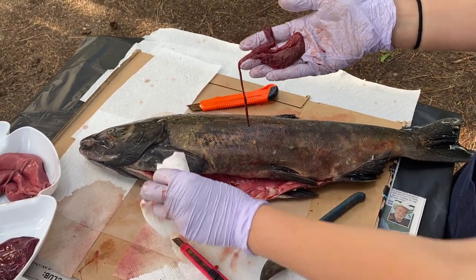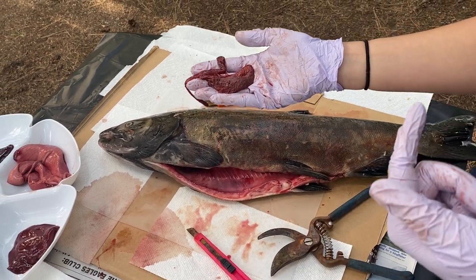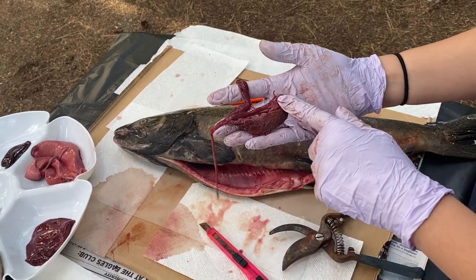So these guys were born in the stream, they went out to the ocean, they ate as much as they could, and as soon as they hit that fresh water to come back to spawn, they stopped eating. That's why its stomach is so small.